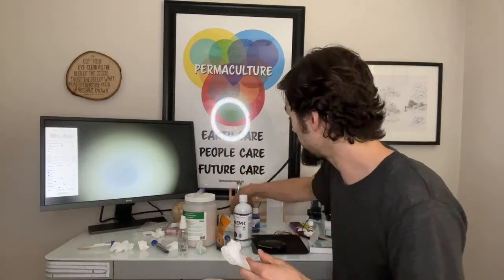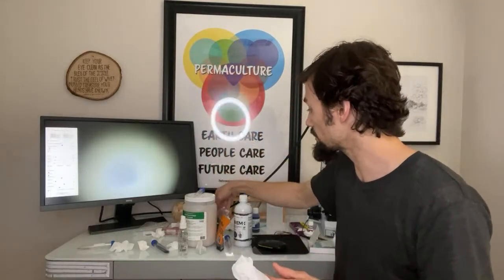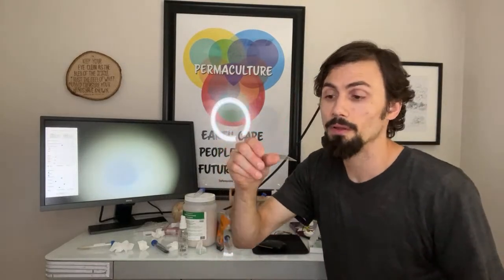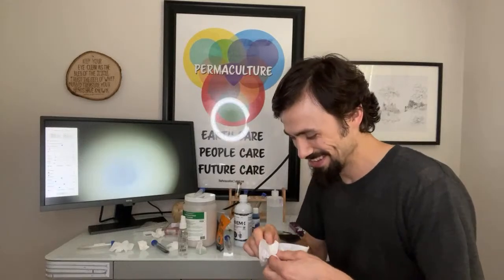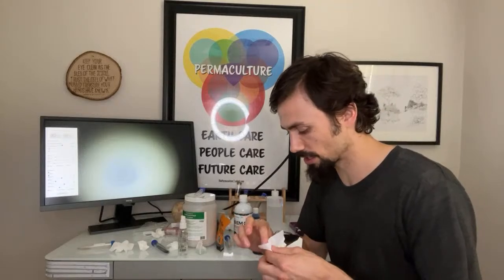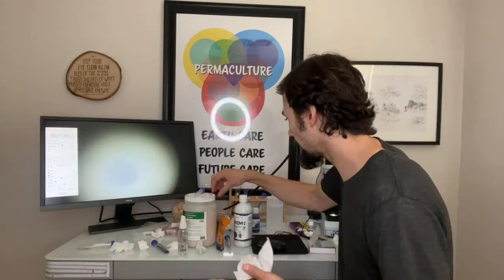We'll also do dark field. That's here, but it's oil. So the second I put this on and put it below and have it come up and touch the bottom of the slide, the bottom of the slide is covered with oil. And so it makes it so I have to clean everything up. So I wanted to be quick and focus on just the comparisons. So that's what I'm doing right now.